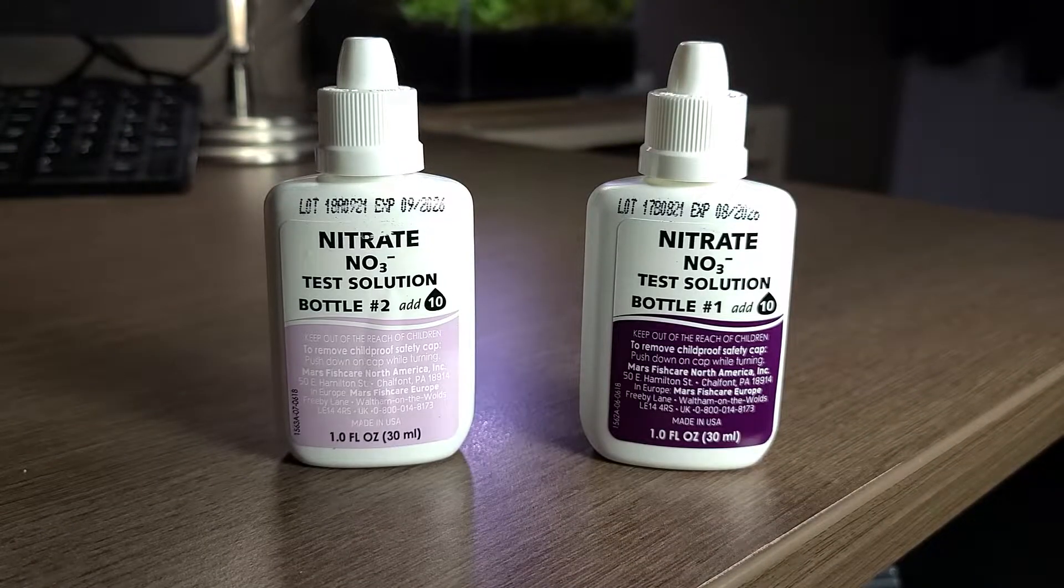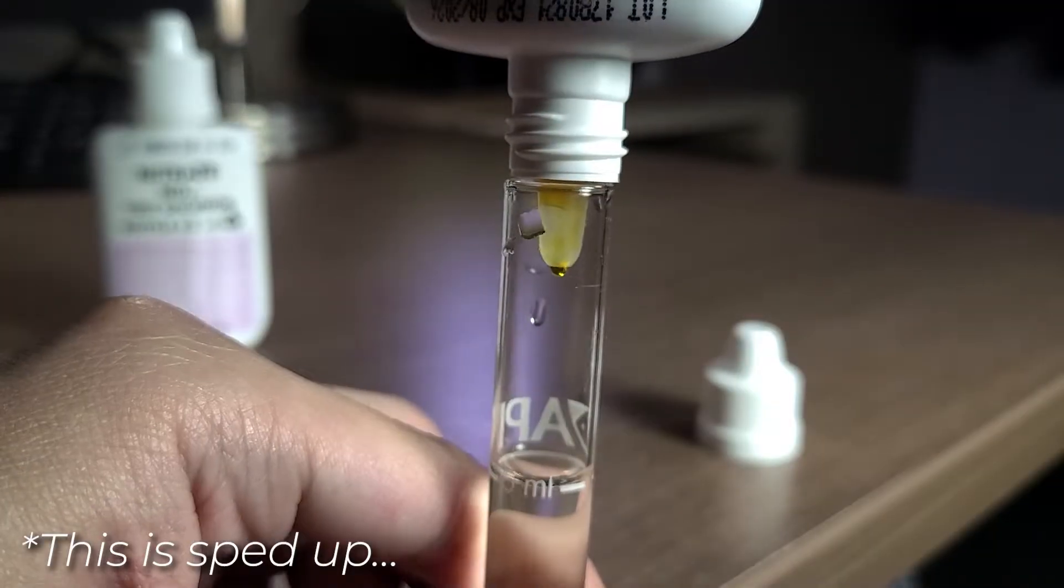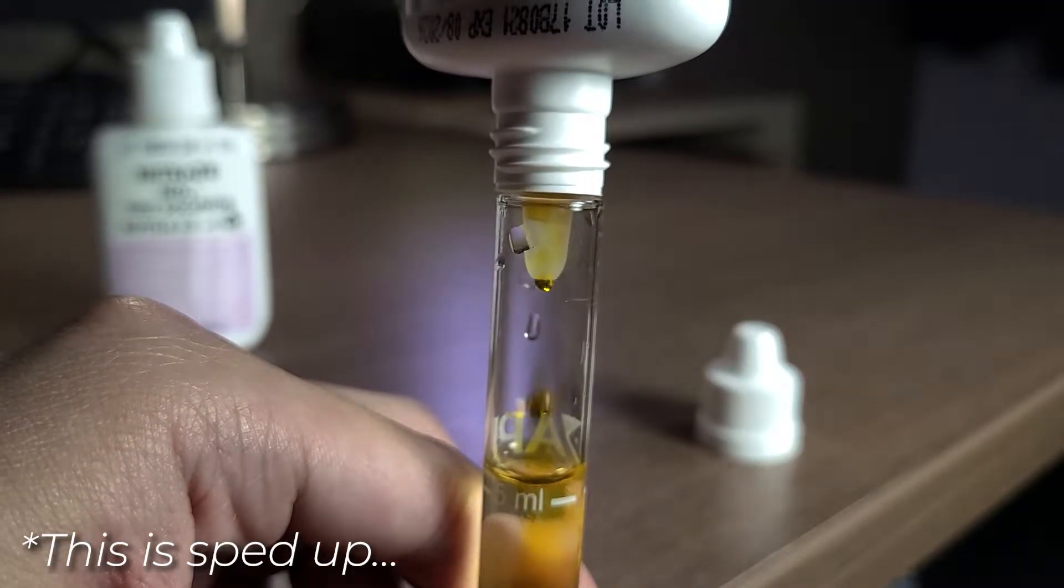For nitrate, we also have two bottles just like the ammonia test. For bottle number one, we will need to add 10 drops and shake the tube a bit.